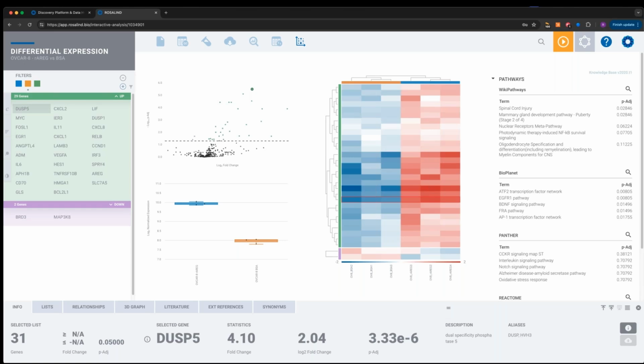So this has a really important role in growth, cellular proliferation, inflammation, immune response, and it's also a really well-known player in cancer and cancer progression. So since we know the design of this experiment and the mechanism of action, it's a really nice positive control for the power of the Rosalind pathway analysis here.